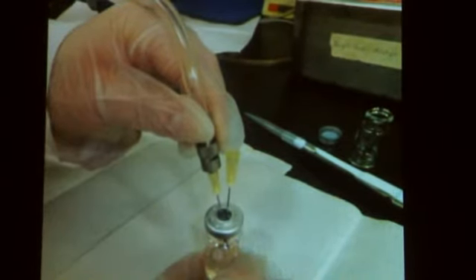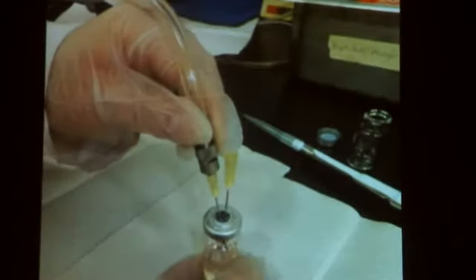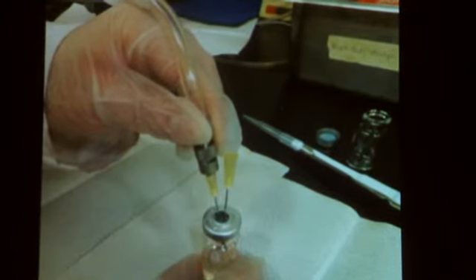So maybe just have one lab partner hold on to the bottles while the other one inserts everything into the lid. Okay, and this is just another picture of one partner holding the bottle and the other one inserting the nitrogen gas tube. And so then we inject the titanium citrate into the vial just by poking it through the lid. It's dark blue in color, so you can't really see it in this picture.